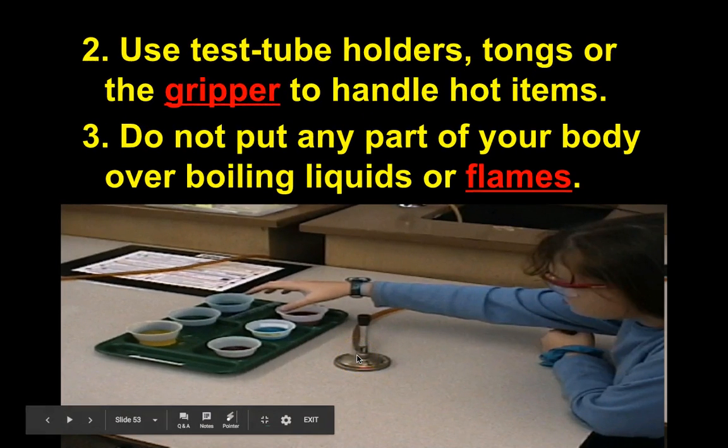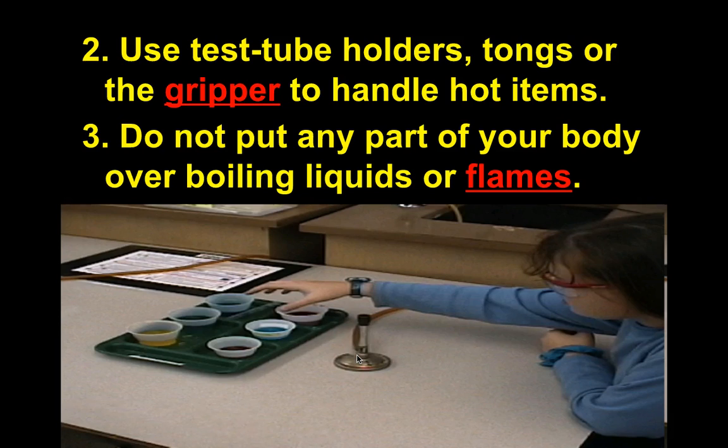Use test tube holders, tongs, or the gripper to handle hot items. I'll typically ask you to use both the gripper and tongs, and I'll show you how before the first Bunsen burner lab. Always use these tools — you don't want to burn yourself.